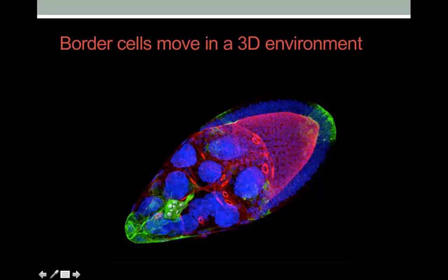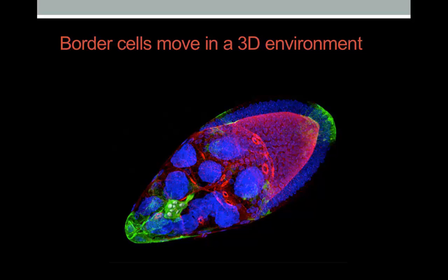So as cell biologists, we like to visualize things. And Imaris really comes into play in this process, because I'm sure Lindsay will be able to show you in more detail later. But as you can see, the border cells send out protrusions, and this red path here is the junctions interface between those big fat nurse cells, and their nuclei were stained in blue here. And the path is in between those nurse cells, and they will avoid the ring canals until they reach the oocyte. So this is really a 3D environment that they are migrating through.